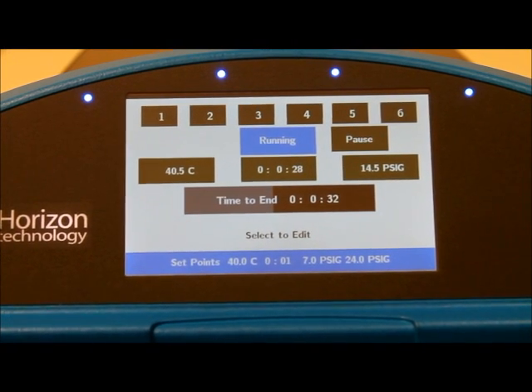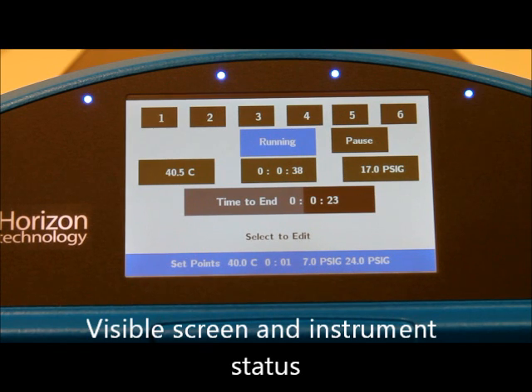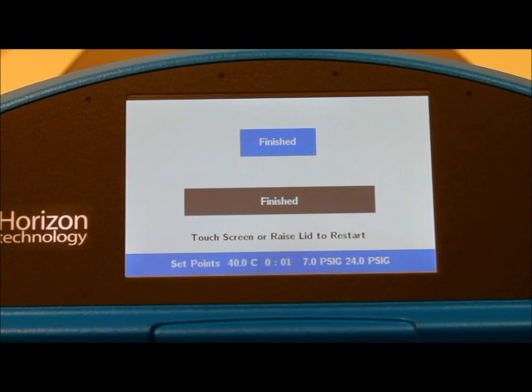You can see the lights above the software show which manifolds are currently active — very easy to see from any position in the laboratory. The buzzer tells us that it's time to return to this equipment and transfer the samples to the instrument.